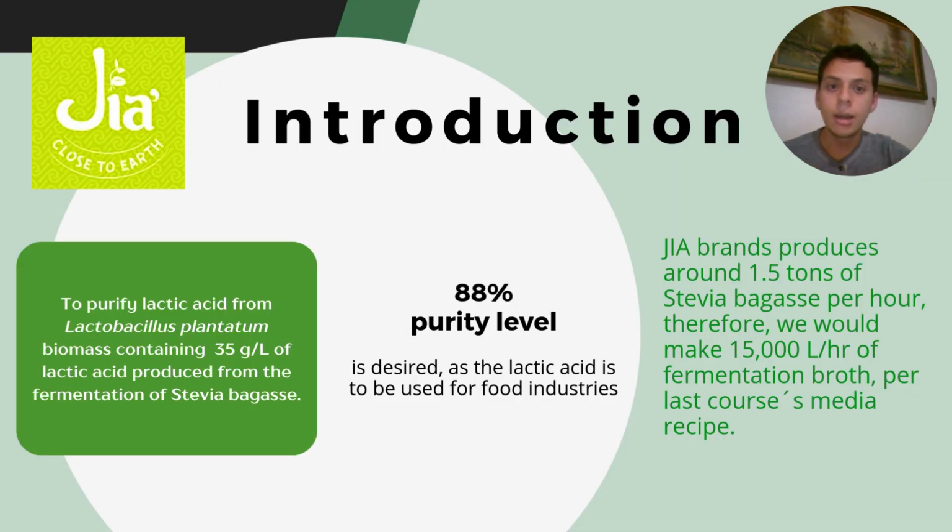As an introduction, our challenge consisted of helping GIA Brands purify a lactic acid fermentation broth produced from stevia bagasse by the use of Lactobacillus plantarum bacteria. This fermentation broth has a lactic acid concentration of 35 grams per liter, and we seek to purify it up to the 88% purity level.